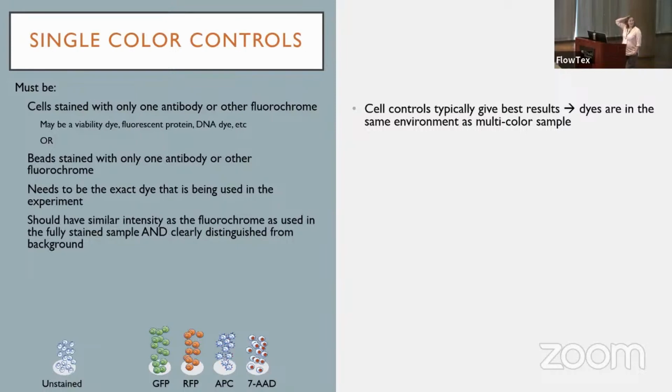Okay. So we've already talked about whether we really need them. The answer is yes. Now the question is, well, I don't know. Do I really need cell controls or do I need bead controls? Which is best? Which is going to give me the best answer? Lisa, just tell me what the answer is. I get this a lot, right? Just tell me what the answer is. Well, realistically, it depends on a bunch of variables, which Peter again went into, right? So this is, again, not new information.